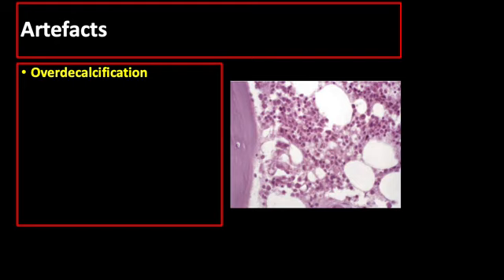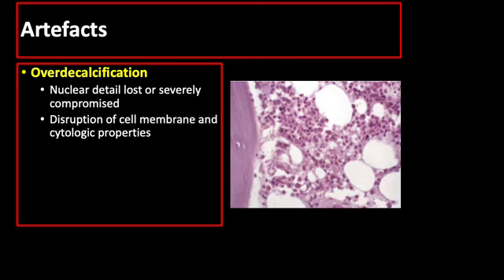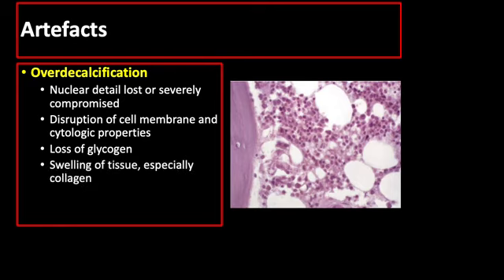On the other hand, if you do over decalcification, you expect nuclear details that are lost or severely compromised, disruption of cell membrane and cytologic properties, loss of glycogen, and swelling of tissue, especially the collagen. And that's the end of our lecture.